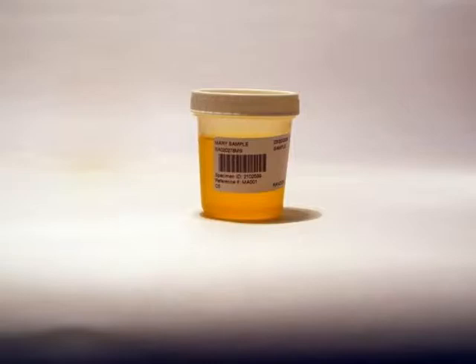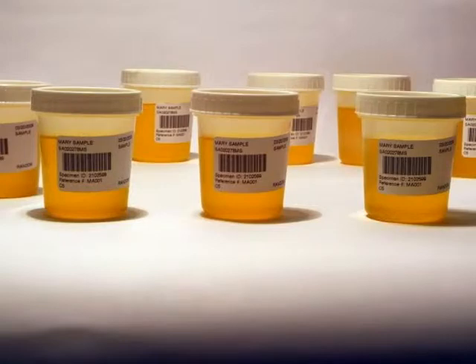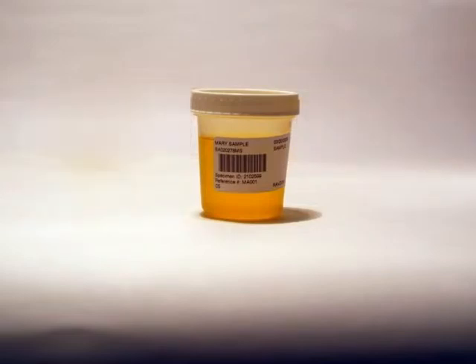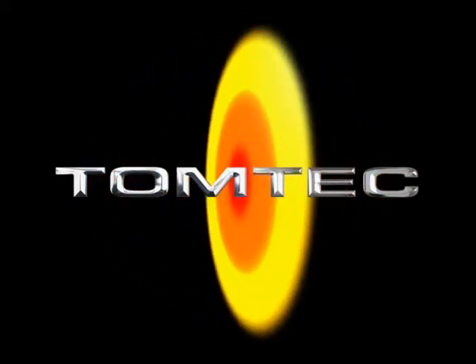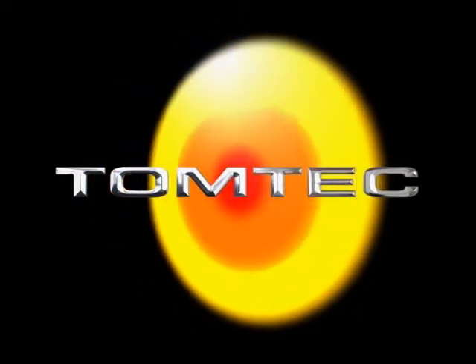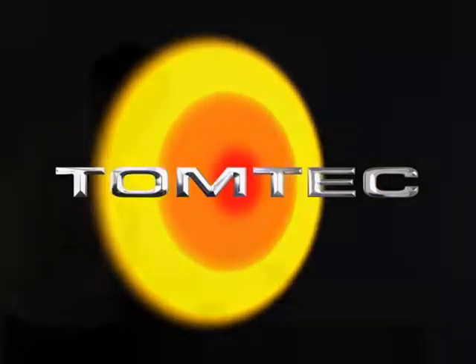If there was a common container used by everyone, a mechanical device could be used. However, the cost of urine screening is very competitive. Processing costs are of great concern. It is very questionable whether a large-scale automation would be cost justified. TomTec, in conjunction with some of our creative customers, can offer a unique solution to the problem. It is both low cost and quick.